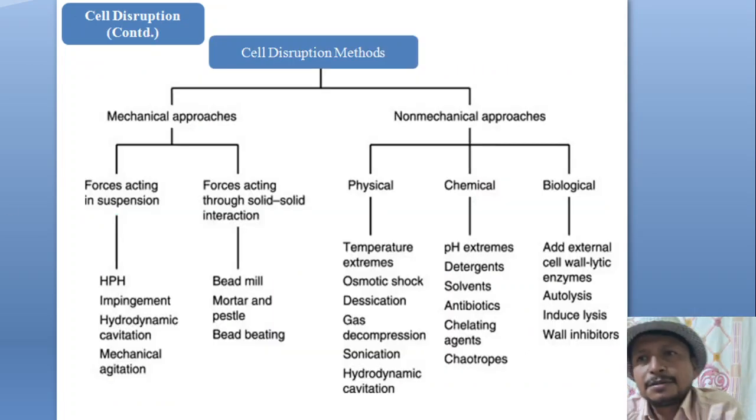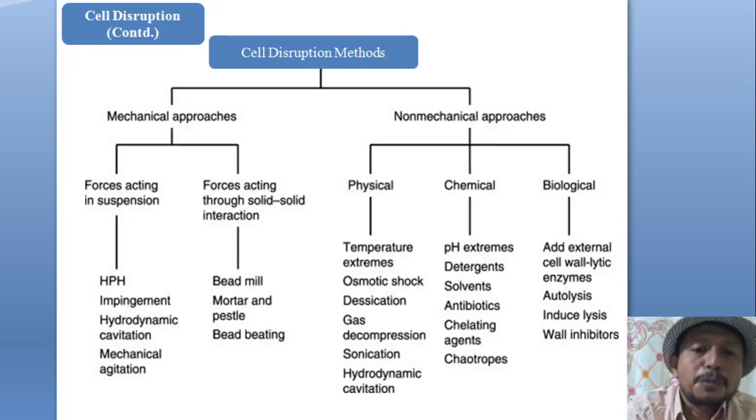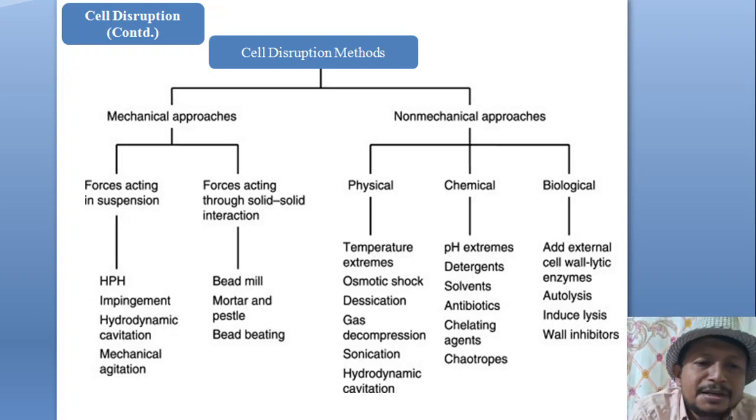We have also understood that the cell disruption methods broadly can be classified into a mechanical approach and a non-mechanical approach. In the mechanical approach, we have forces acting in suspension and forces acting through solid-solid interactions. Under forces acting in suspension, we have different ways we can do it. In the non-mechanical approach, we have the physical, the chemical, and the biological methods. So these are different classes of cell disruption methods.